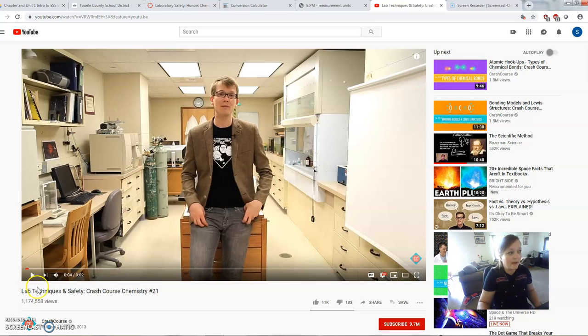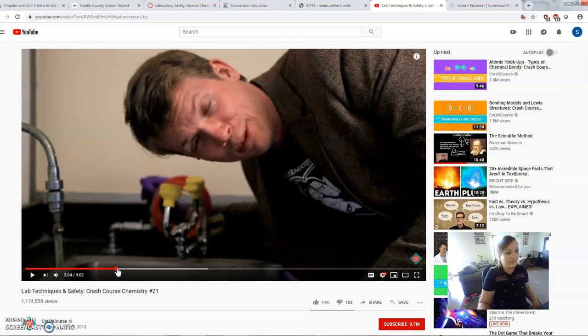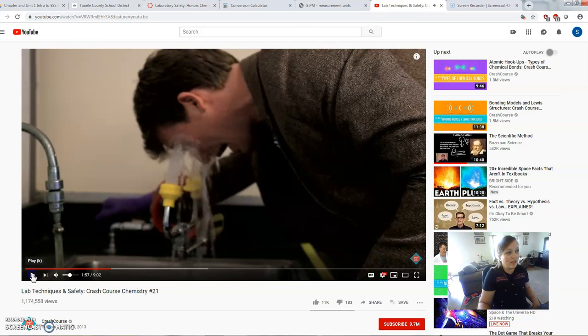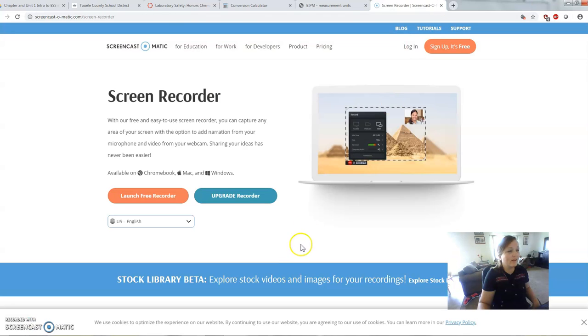His video is on lab techniques and safety. It is Crash Course Chemistry number 21. So for whatever reason your Chromebook is not playing the link, type in lab techniques and safety Crash Course Chemistry number 21 and you'll get the video. So he's going to talk a little bit about lab safety. Okay, and so you'll be able to see him look through that. He's going to show little silly different things because, you know, that's what Hank does, like things like turning on the water fountain and the eye washer. And he'll teach you how to use some of those different things that we have in the back of our classroom, which is really kind of entertaining to watch.